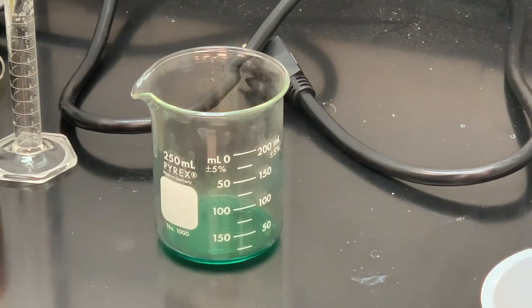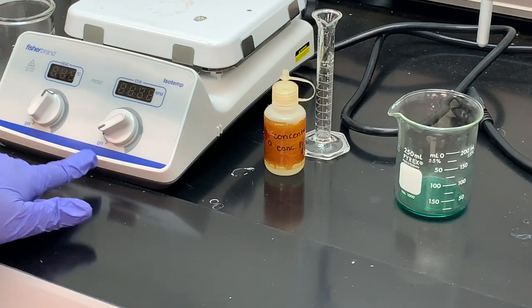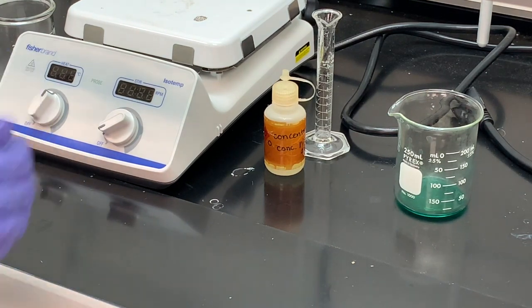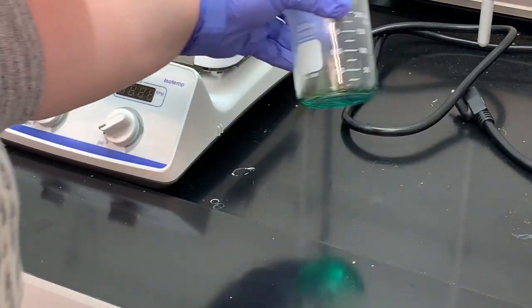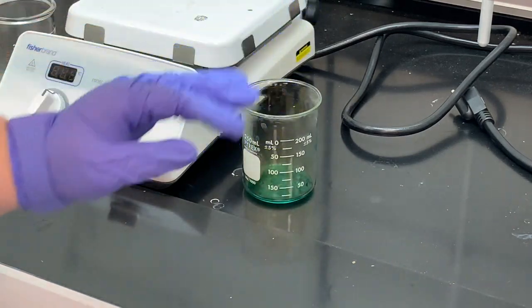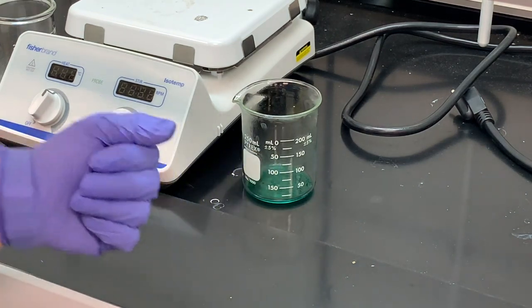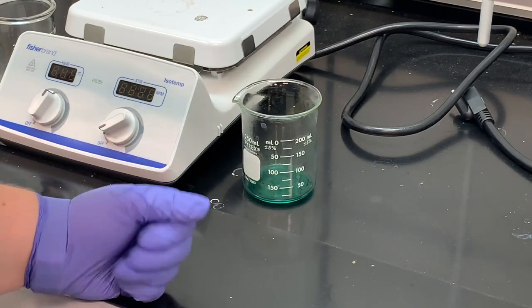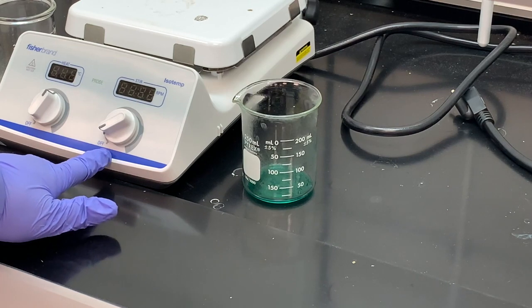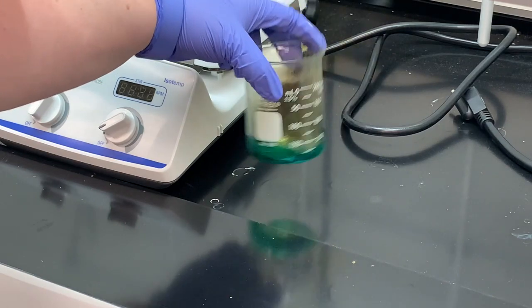So now we're looking to get a blue solution, and we want that blue solution to match that blue that's on this hot plate. So this is the color that we're looking for before we move on to the next step. Right now our solution is kind of greenish tealish because it still has that brown gas in it. So I'm going to take it inside the hood and I'm going to just swirl it until that reaction is completely done and that solution is blue, like this blue on the hot plate here. Then I'll be ready to move on in the procedure where you're adding water.